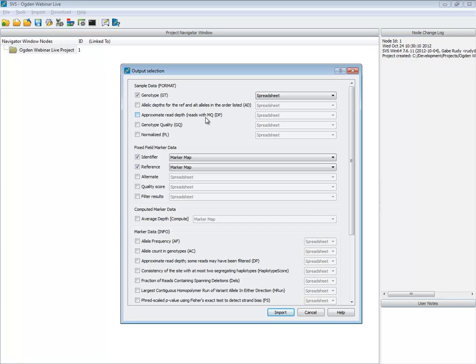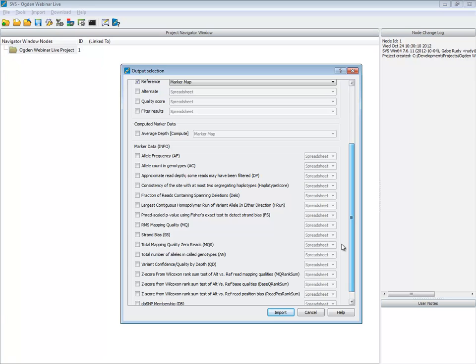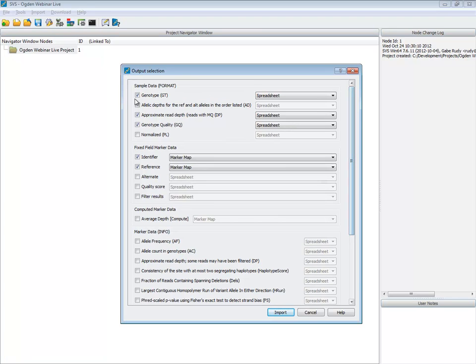So let's go ahead, and you see there's a couple of different alternative data points with our genotypes, which is going to be our most important thing to start with. We're going to grab read depths and genotype qualities. Again, there's a lot of extra supplemental information here. Most of this is just statistics based on GATK's methodology, but we can focus on read depth and genotype quality.